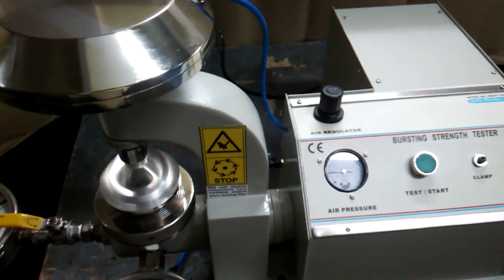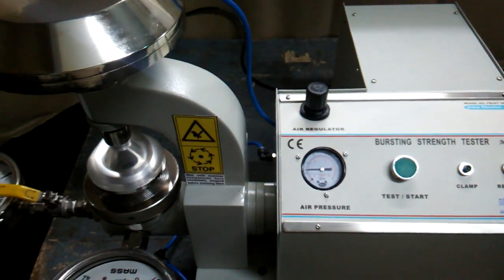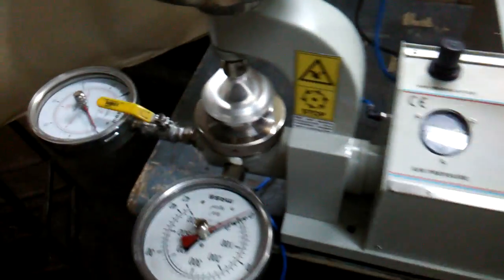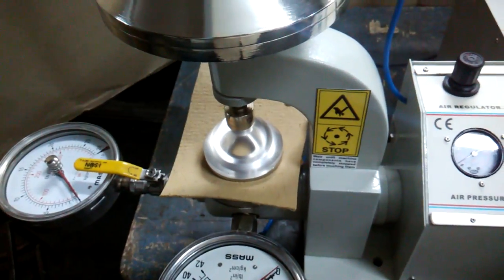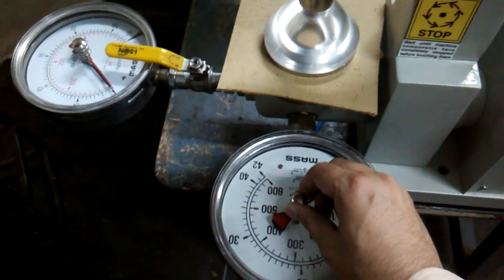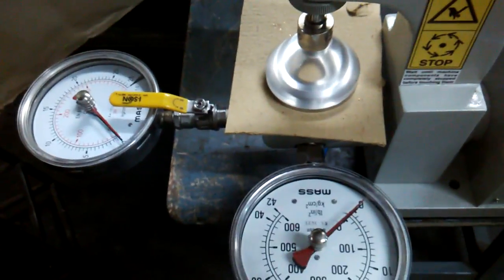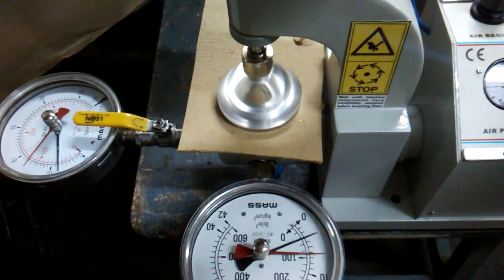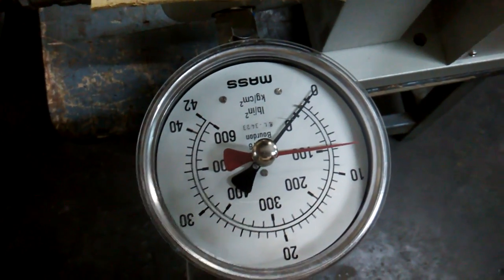The specimen is ready. You can place the specimen here, then clamp it and set it to zero from both sides. Switch and check whether the burst occurs — as soon as the burst occurs, release the test and start button. Here you can see it's 100 psi of pressure, and 100 psi over here too.